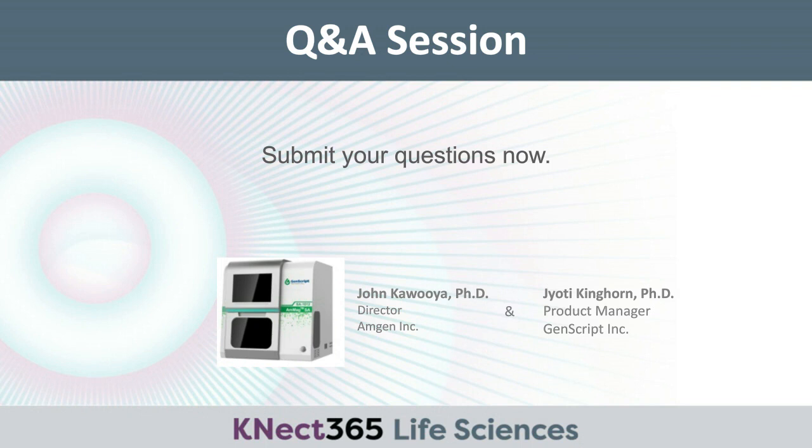That's perfect. Okay. Another question we have, is it correct to say mag beads are more suited for screening stage of protein purification? Is that towards me or to Jyoti? I think, John, you can answer that. Okay, so I can go ahead. So the question is about what? Sorry, if you can repeat the question. Sure. Is it correct to say mag beads are more suited for screening stage of protein purification?